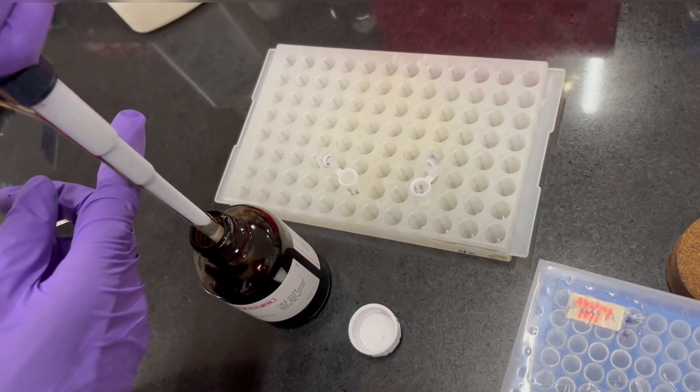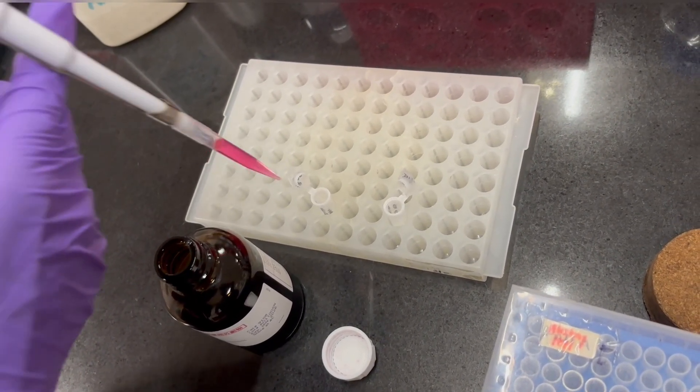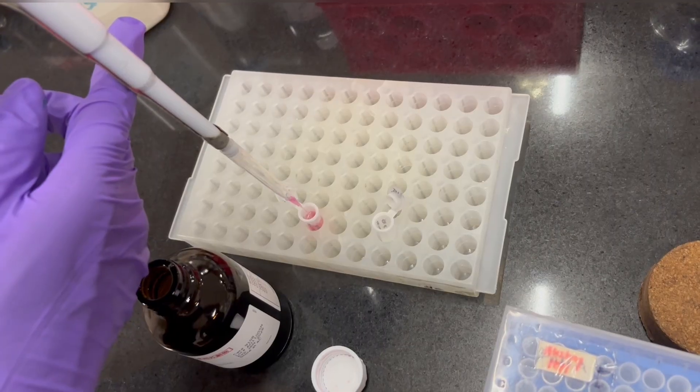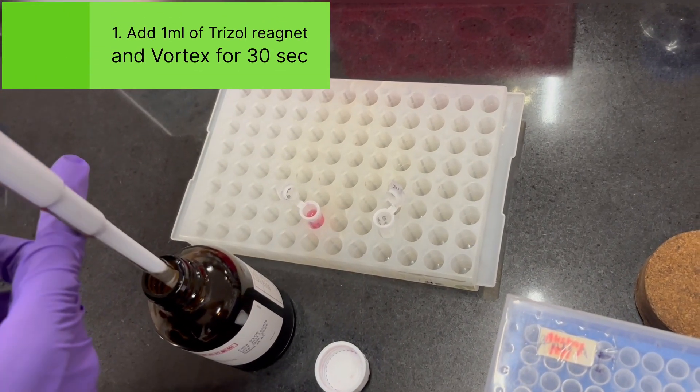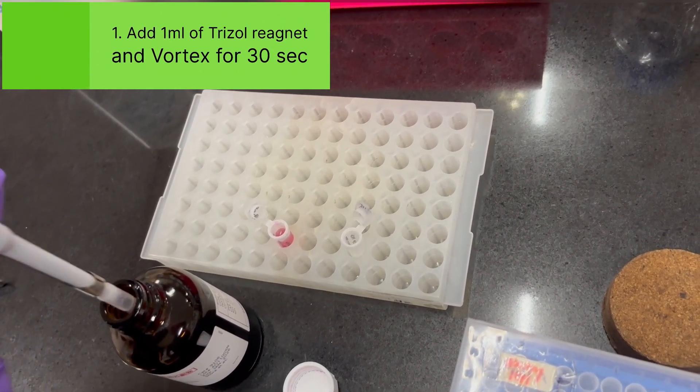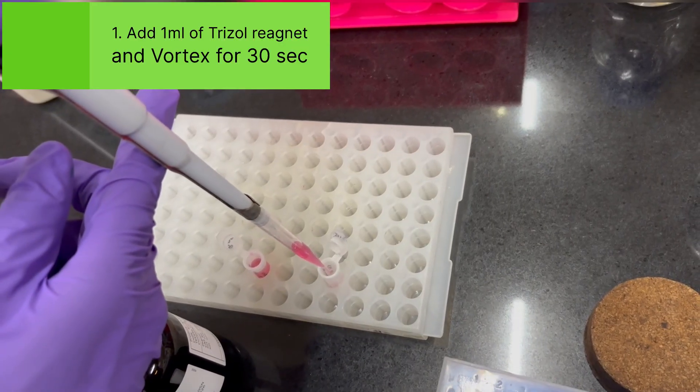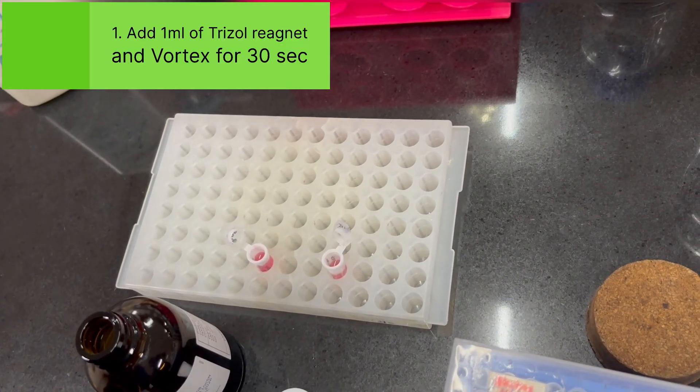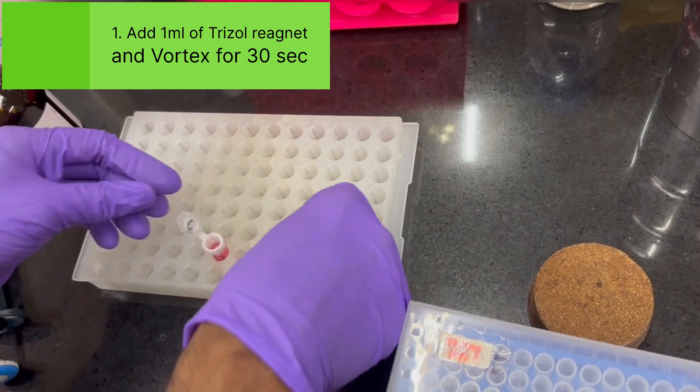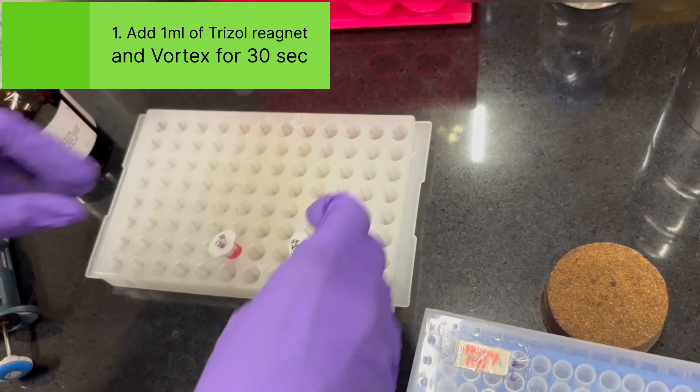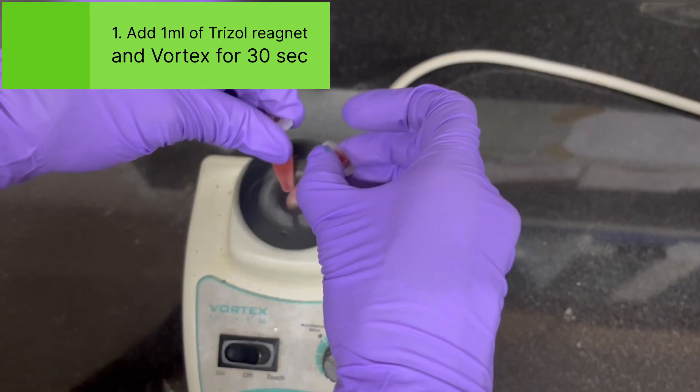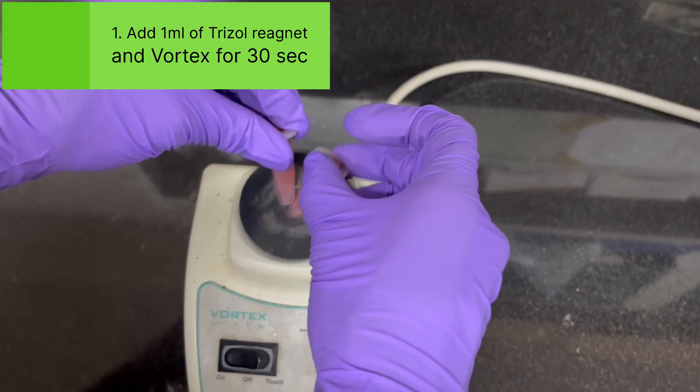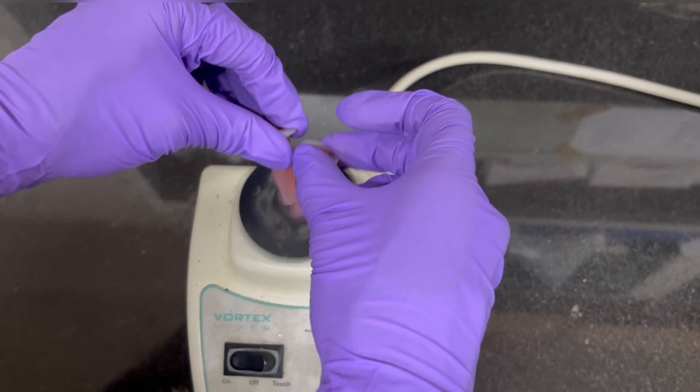Which I have explained earlier, the principle I have explained earlier. You just add 1 ml of Trizol reagent into the respective tubes. And after adding Trizol if your tissue thaws, don't worry. Here you close the tubes and then vortex it for 30 seconds in a vortexer or vortex machine you can use.